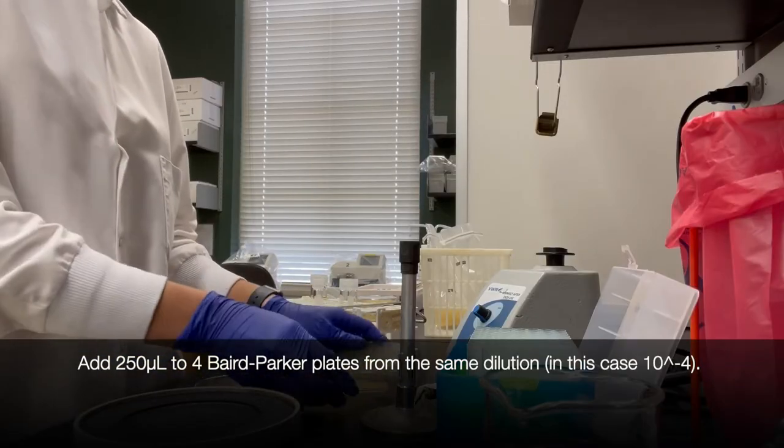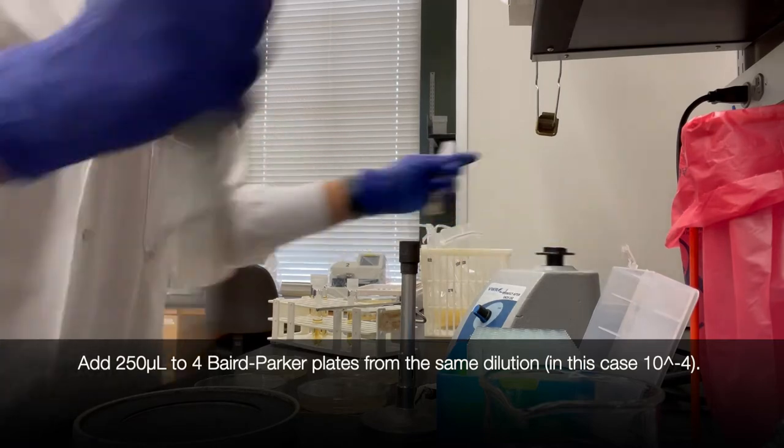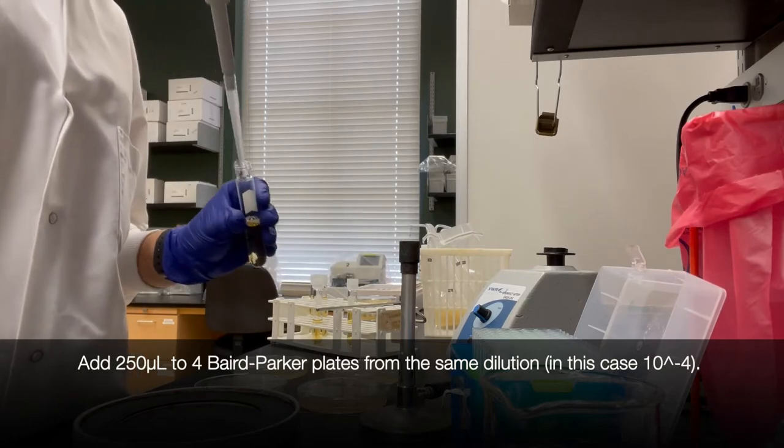This week we're going to use a new plating method. We're going to add 250 microliters to 4 Baird-Parker plates from the same dilution. In this case we're using 10 to the minus 4.